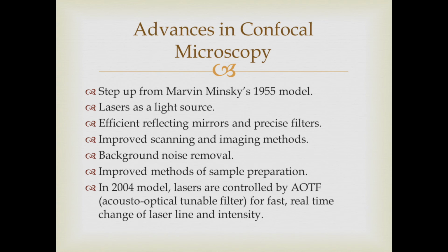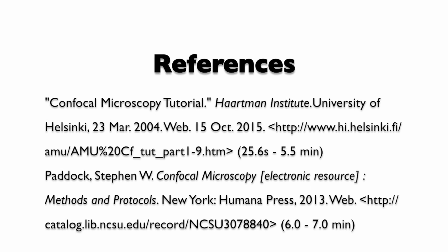And that leads us to sample preparation methods, which have also been improved and are not only more precise, but more sterile too. The latest development known as of yet is that in the 2004 model, the lasers in confocal microscopes are now being controlled by acousto-optical tunable filters for fast, real-time change of laser line and intensity. And these are some of the variations of confocal microscopes.